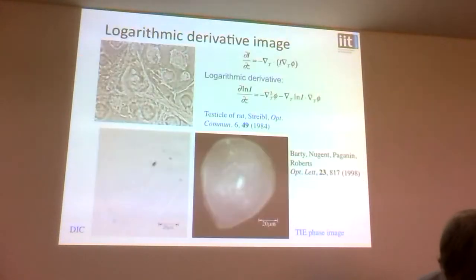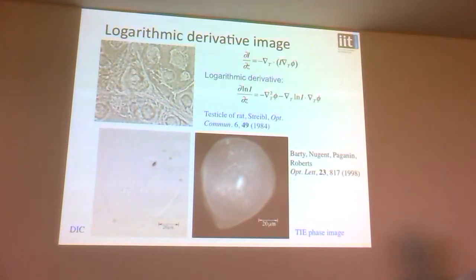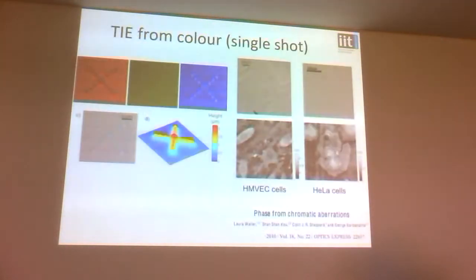Now, of course, the way you do this is you've got to measure the intensity gradient. So you actually have to measure two defocused images. It's a bit similar to the way I described before, which was for a weak object, but this one doesn't rely on it being a weak object. We measure the intensity in two planes and subtract them in order to get the axial longitudinal gradient of the intensity. In practice, normally people measure it on three planes because you get a more accurate measurement of the phase gradient and of the central intensity. You need the I as well as the dI/dz. So they normally do it from three images. Of course, measuring three images takes some time, so we're back on your point. If you've got something which is changing, moving, then that's a disadvantage. So there is some advantage in doing it all at once. That was this paper.